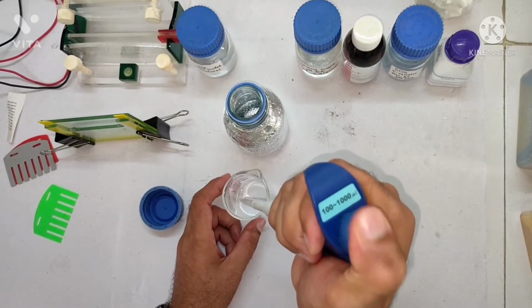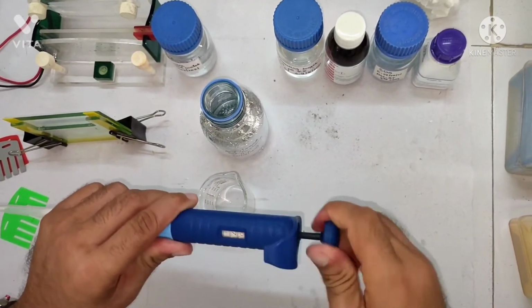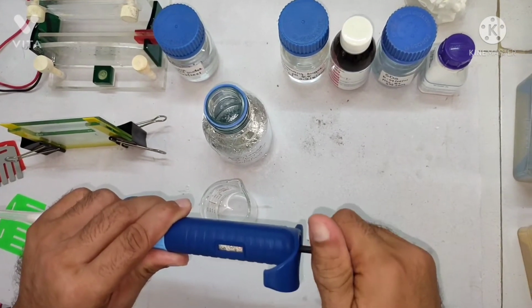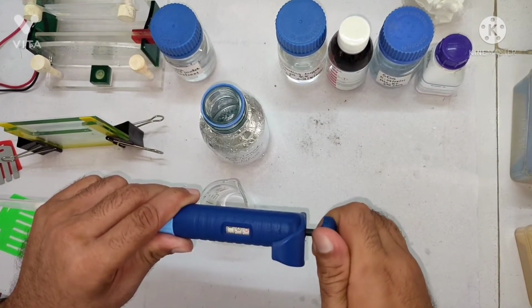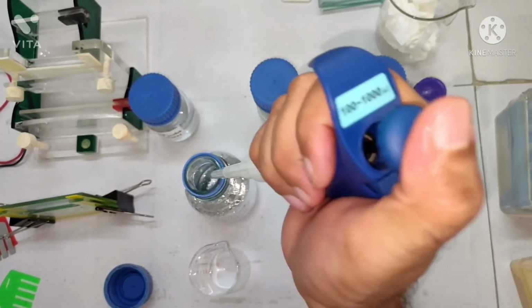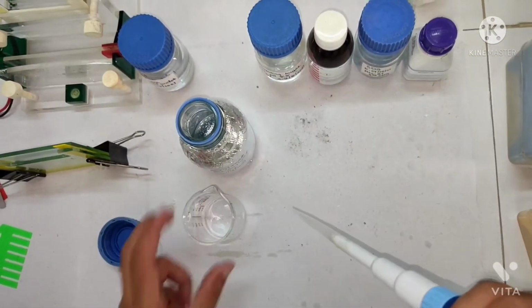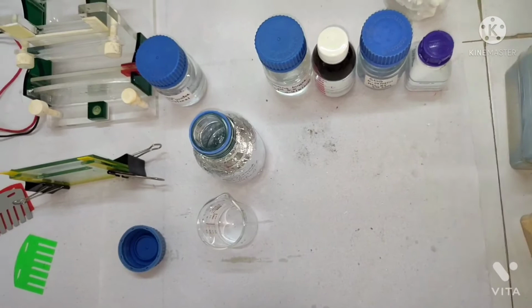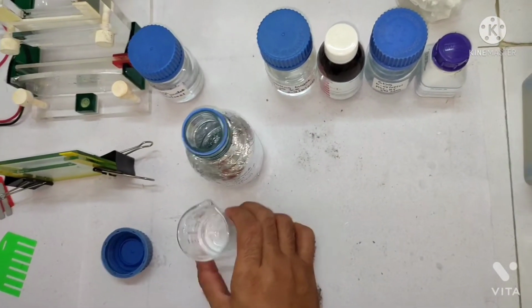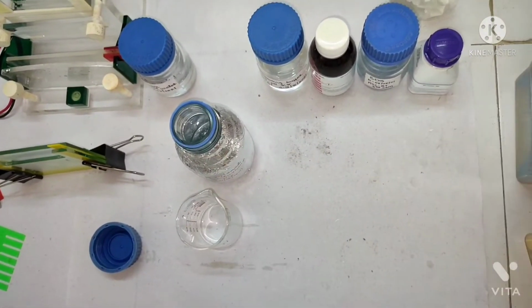So this is 3 ml. Now this is 3.3, right? So I am just setting the pipette. So this is 3.33. All right. So this is it, and mix well. Mix the water and the acrylamide bis-acrylamide solution well. Okay, then we have to take 4x Tris buffer, which is pH 8.8, right?